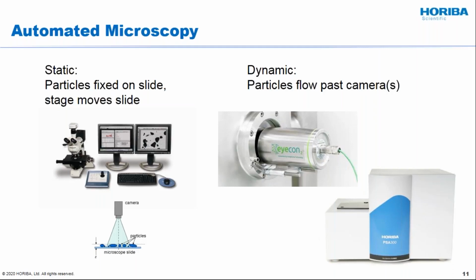Now, one of the things that has been around for a while now is, on the right-hand side of the screen, you can see we're now doing online digital image analysis. So all that you're doing is, instead of the left-hand side where you have a microscope slide, in its place you have some sort of a flowing system of particles that will be measured by this probe.